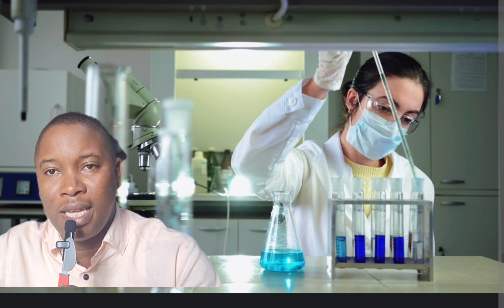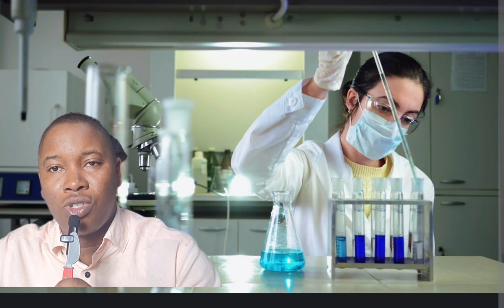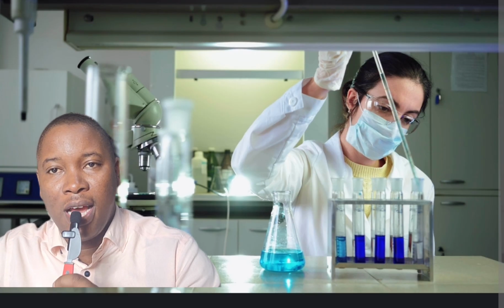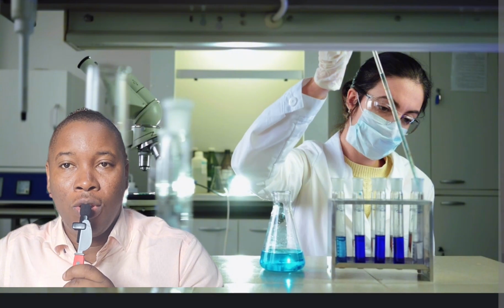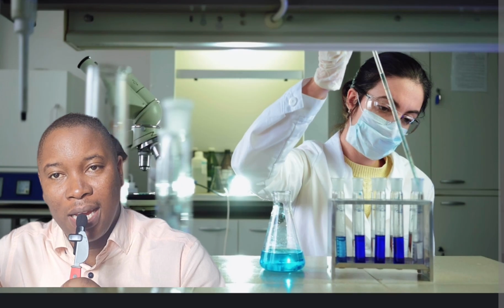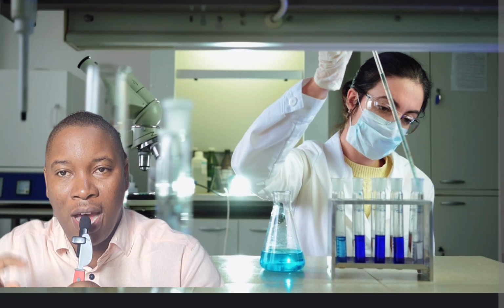It's a simple test, and it's a well-used test in microbiology for us to identify bacteria from the family Enterobacteriaceae. What you are looking for is the presence of tryptophanase in the bacteria. The question is, does this bacteria have this enzyme or not?